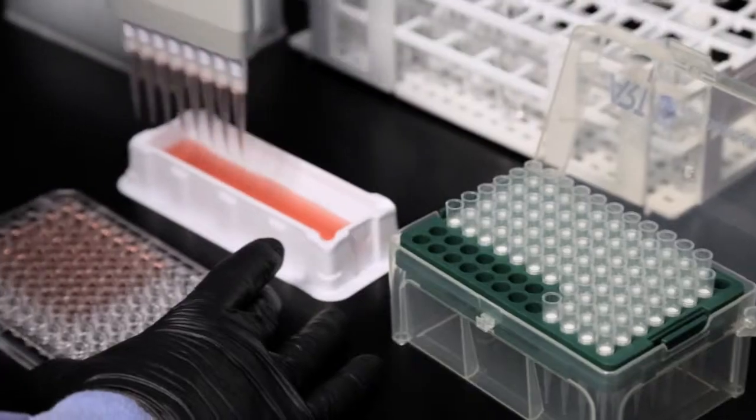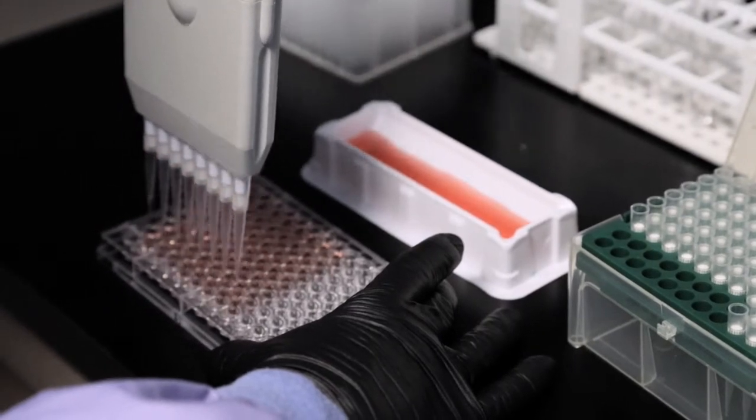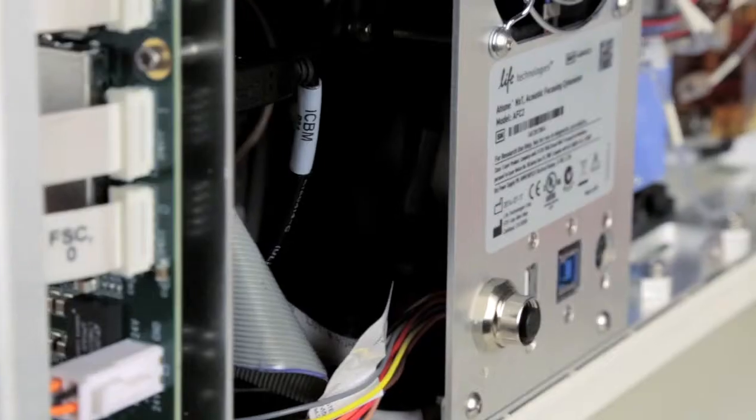Another issue with traditional systems I have found really annoying is losing my sample. The instrument initially aspirates so much of my sample that I don't have any cells left.